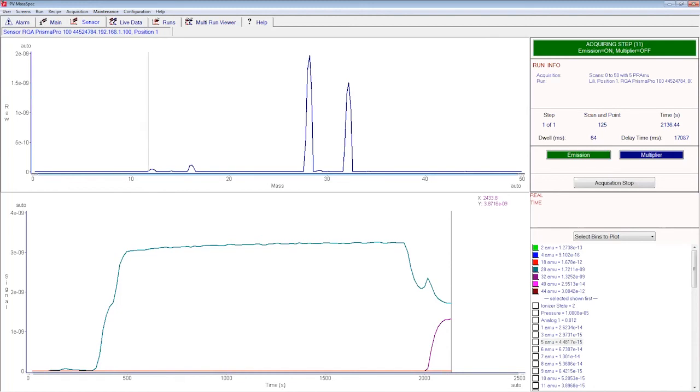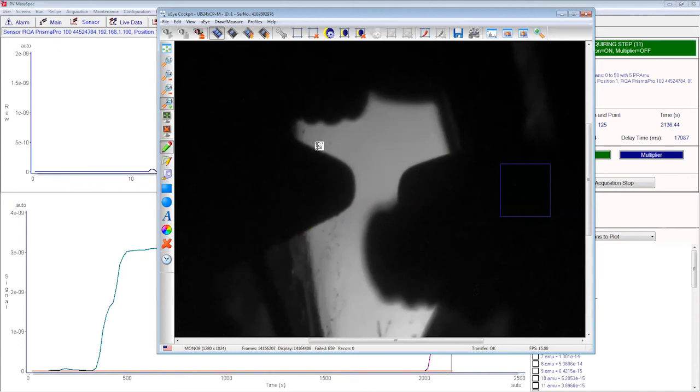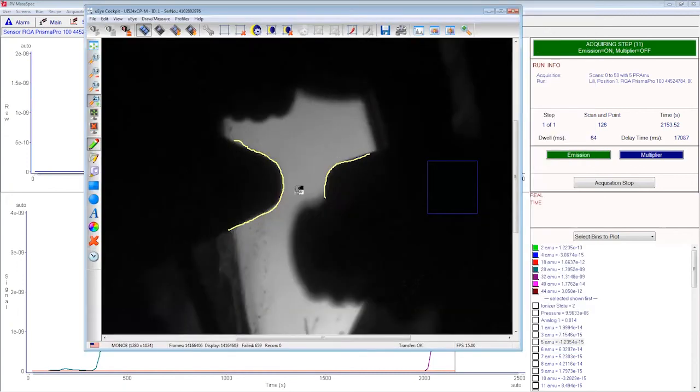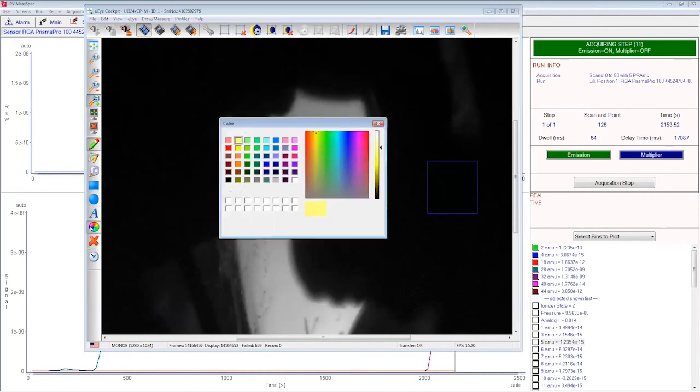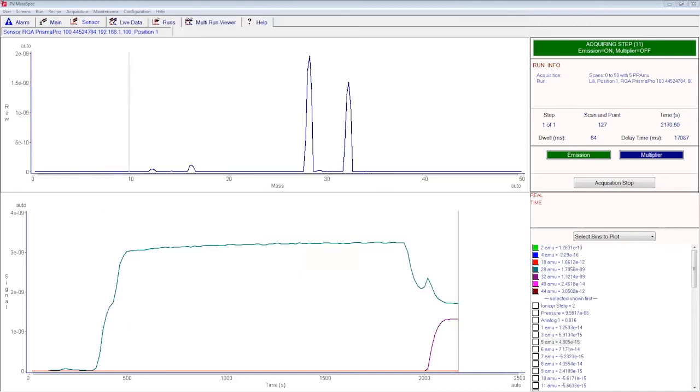Then at some point we will stop the measurement and we will increase the temperature. In this case, again, we need to check the position. If the heating is fast, there is no time for the manipulator to get warm much, so it will not expand too much. Okay, really small. And our measurement point is somewhere here in the middle, right? Okay, anyway, it doesn't matter. So, let's put this aside, and we can start.